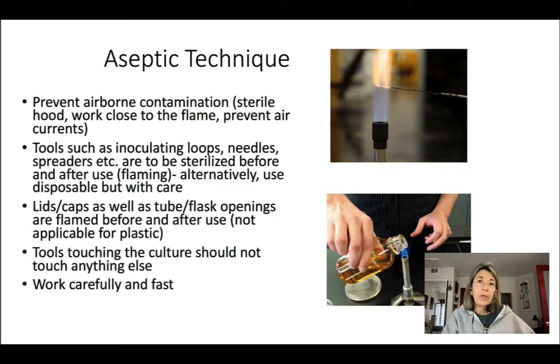So when you do the aseptic technique labs or simulation, you are going to see emphasis on some of these practices. Like it tells you, touch that blue button and check what happened. And if you did something wrong, it will take you back and you have to repeat it. So some of it is just keeping your area where you work clean. So you have to wipe it down, for example.